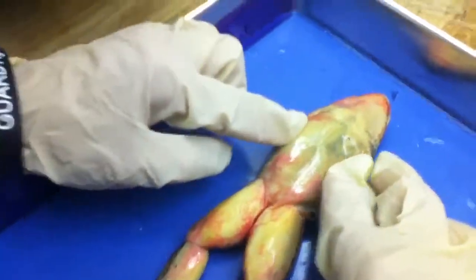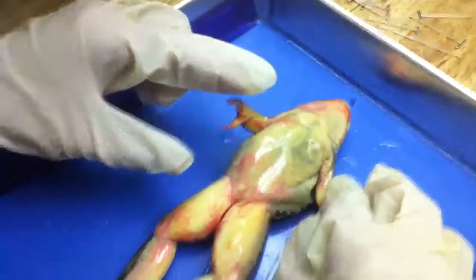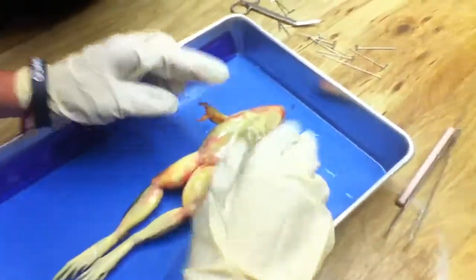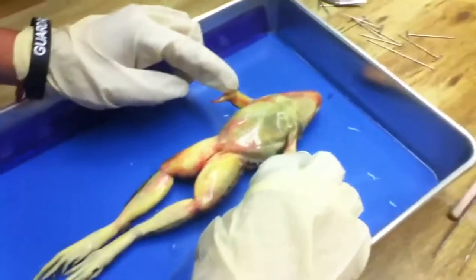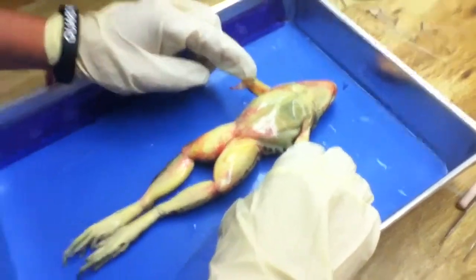Okay. Are you gonna use that instead of the camera to take your pictures? She's recording. Put your goggles on. If you're gonna do this, I don't want anything in your eyes. Okay, put goggles on. You need more glasses. Dissecting pins, they're in the box.